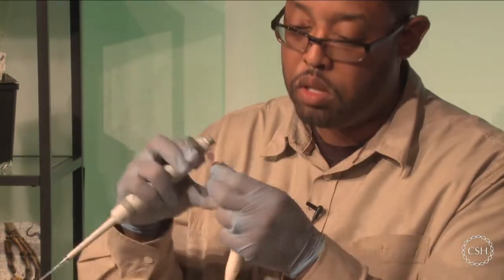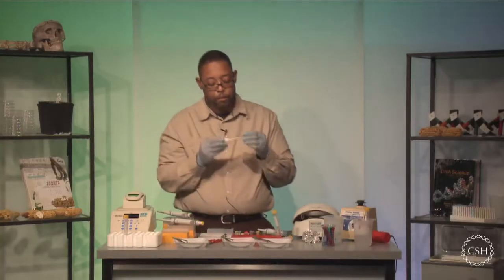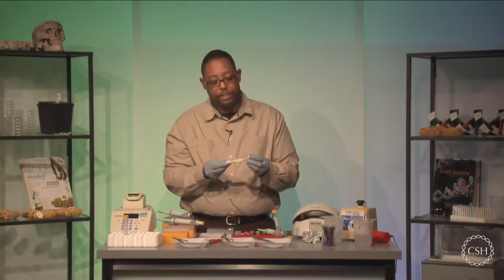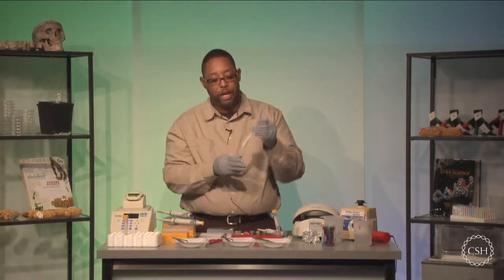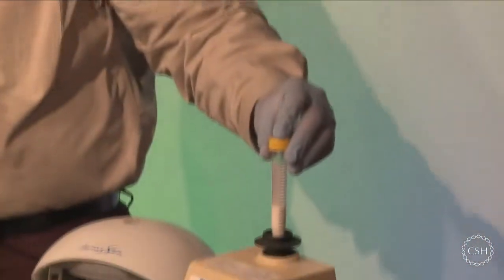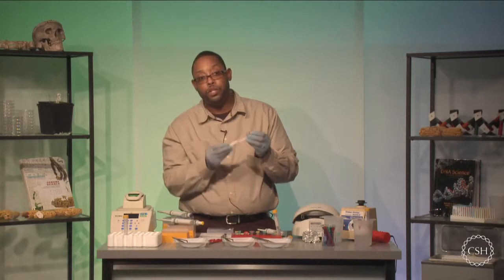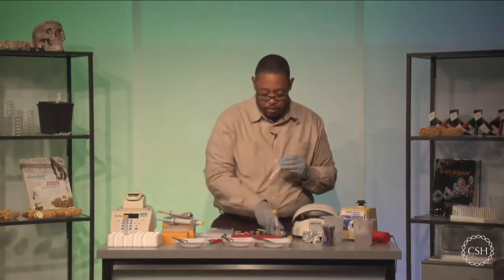Okay. Now, one thing I want you to be sure of is that when you have the silica resin, you've mixed it up pretty thoroughly. It sometimes can have a sediment which falls to the very bottom. If you haven't mixed this very well, when you flip and flip back, you're going to see a sort of paste at the bottom of the test tube. If at all possible, hand vortex, or if you have a vortexer, please use that to mix up your sample. Let's try to avoid having a sediment of material at the bottom of the silica resin test tube. You should not have this when you're working in the classroom because you will have a smaller aliquot of this. I'm going to continue to add this to my other test tubes.